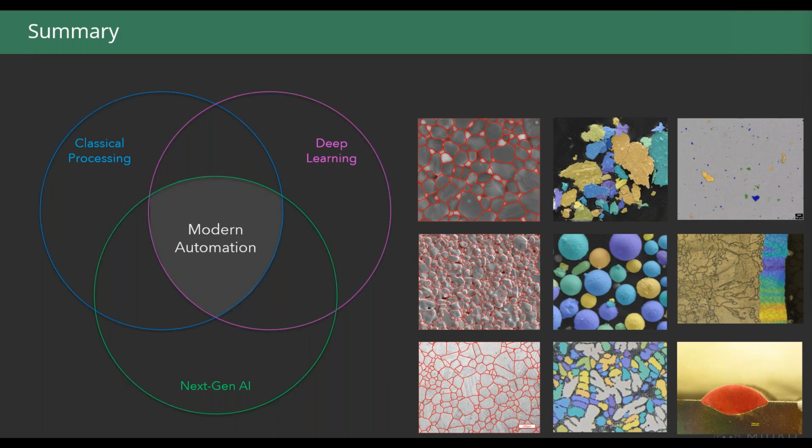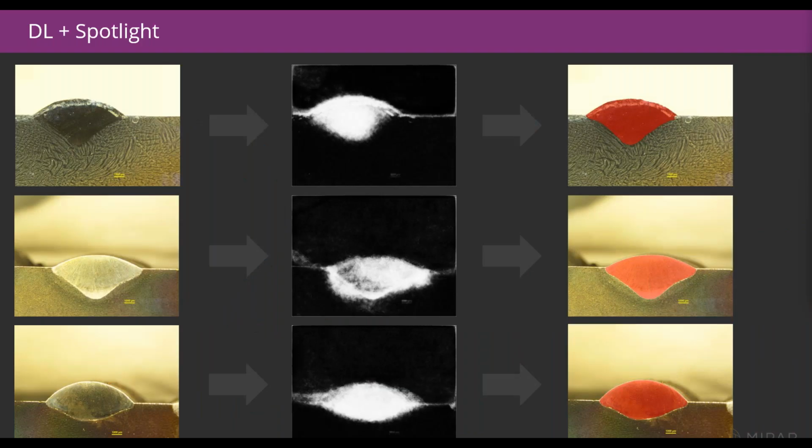So if I can go back to this slide here where we look at the different weld segmentations, we use the Snap tool, which is powered by that same model, to objectively detect the edges. As I said, it's been trained on millions of different objects of all types, not just materials, but natural scene imagery, you name it. And from that, it's understood what defines an edge for an object in an image. It's not always the same thing, right?